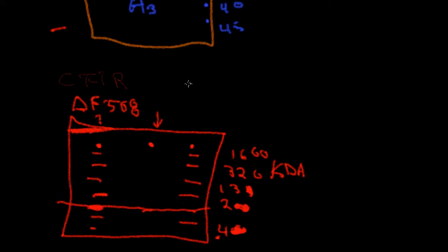And maybe in my experimental system where we were doing gene therapy, we turned down the regulation of that mutant gene. So it looks something like that instead of this big ugly band of whatever gene disease we're looking at. So we can see, gee, look, this band is twice as big over here as it is over here, so this patient's got twice as much RNA being turned out because we manipulated the gene somehow.